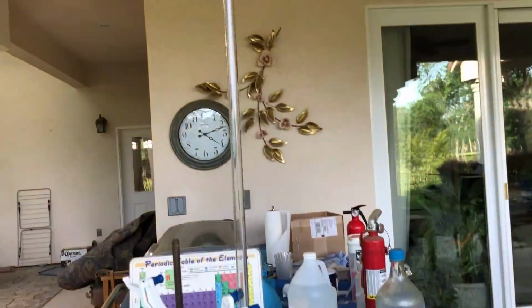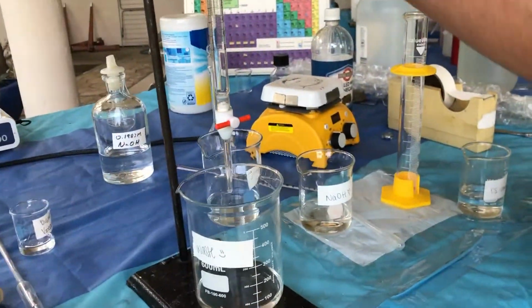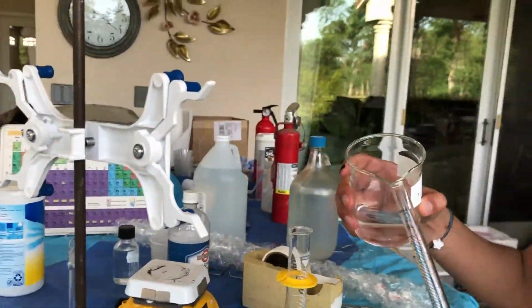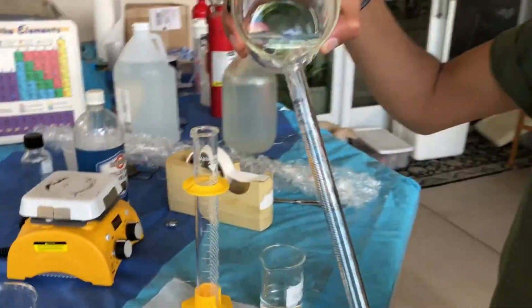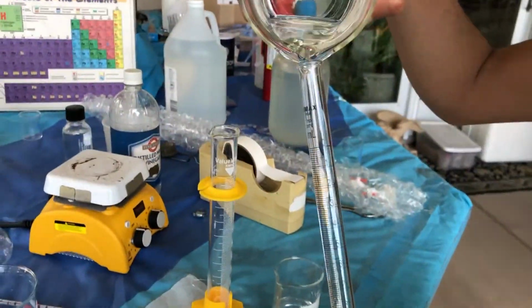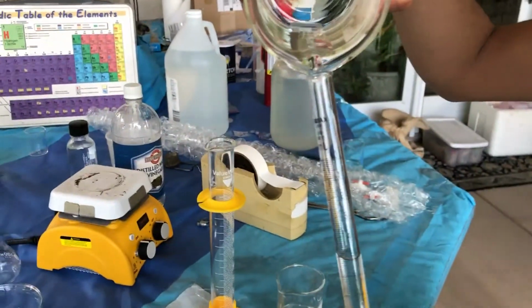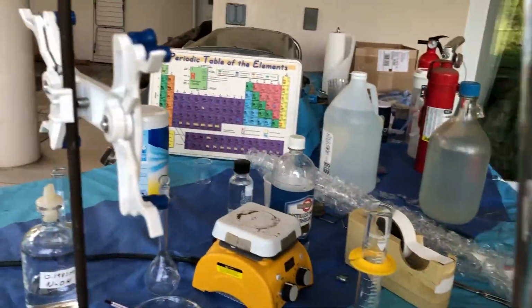We're ready to fill the burette with the sodium hydroxide. So we have the 60 mLs that we filled out earlier. And since we're vertically challenged, we take it off the burette and fill it. We're going to try to get it as close to the 0 mL mark as possible, but we're going to put it a little above because we're going to let some out into the waste. It's fine, it's okay.